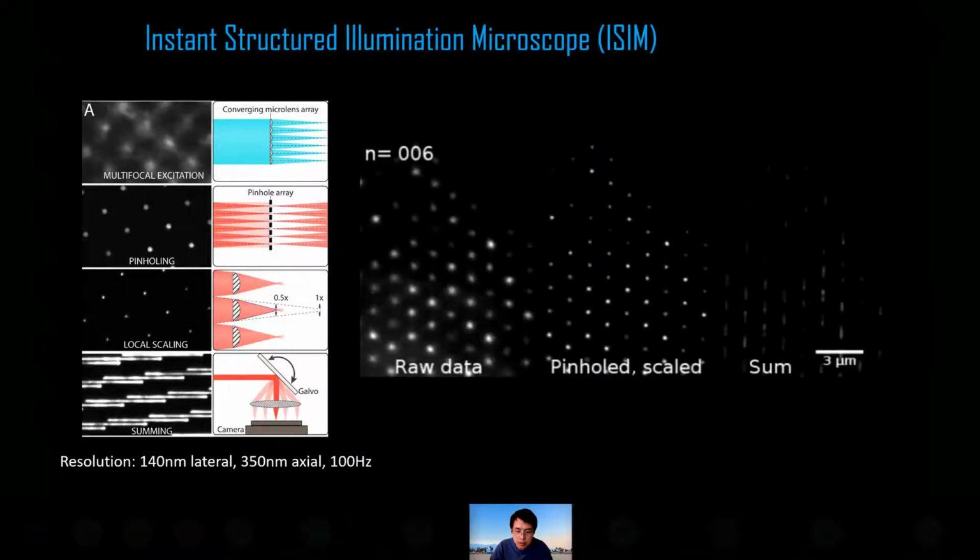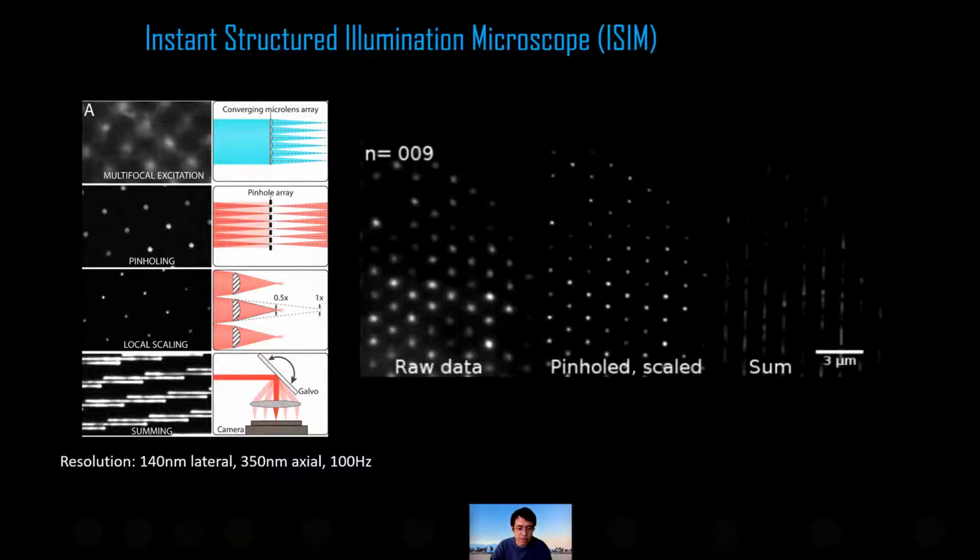So in order to test this idea, the first thing we wanted to try was to see if we can train the 3D RCAN for super resolution image denoising. In this case, we turned to a microscope technology called instant structured illumination microscopy. For people who are not familiar with this technology, you can check the publication related to it in Nature Methods.